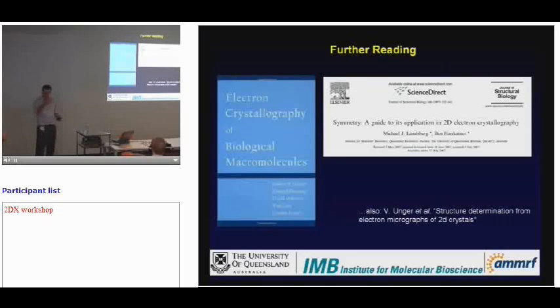There are many examples where it will pick up an incorrect symmetry, and I think the onus really is on the user to go back and check that everything's self-consistent, that sub-symmetries are being satisfied, that the symmetry is present in multiple different images, and even looking at real space maps. I was actually talking about this with Daniel yesterday: when you have biological criteria which you know are satisfied, which would break the symmetry that you have present.